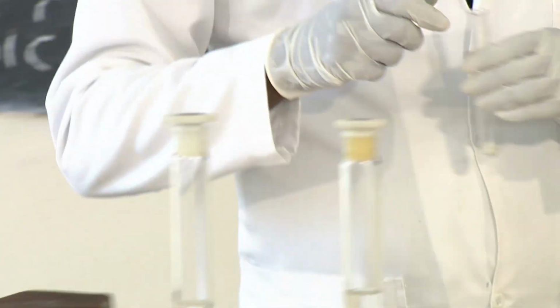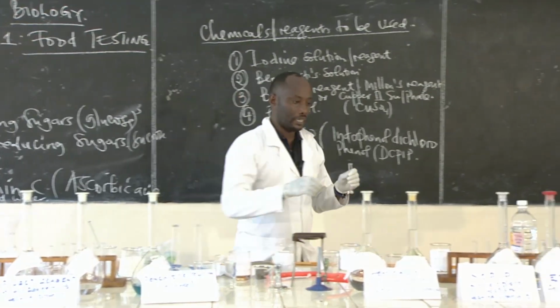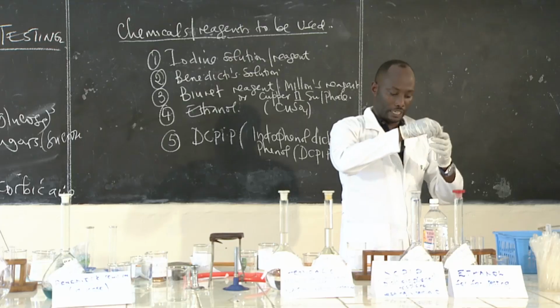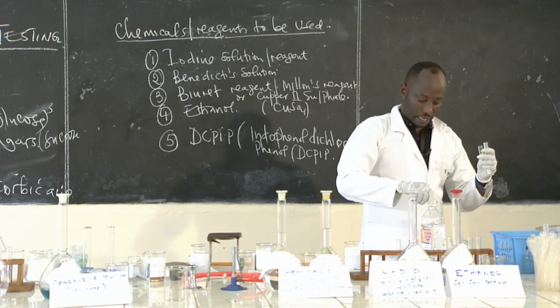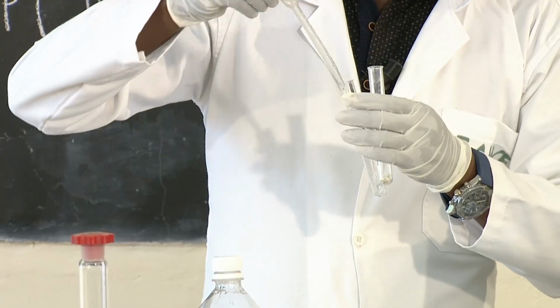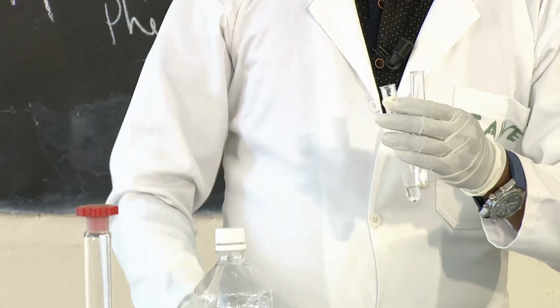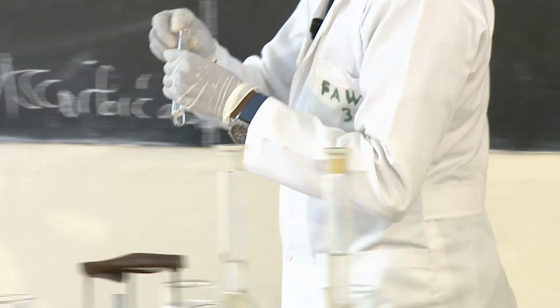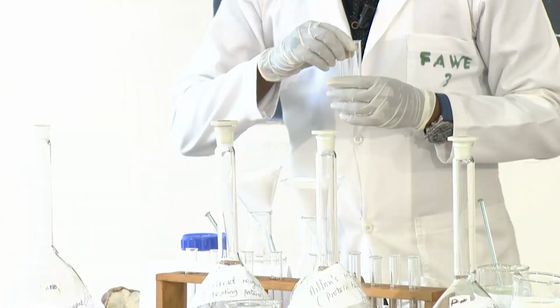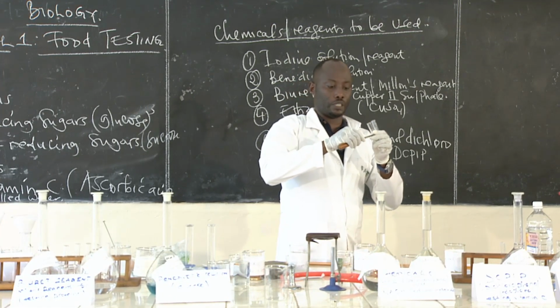Okay. From here, I'm going to put there the iodine solution. Let me first get another test tube and put there the distilled water. I test if it contains starch. Here I put the distilled water to act as a control experiment. Do the sweet potatoes contain starch? Now I will make it, you observe it and tell me if this one is acting as a control experiment.